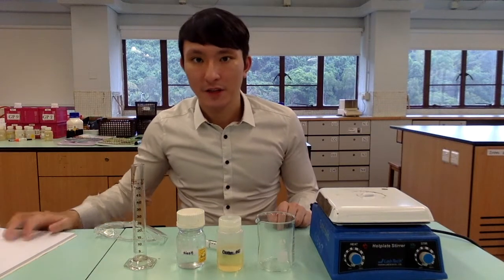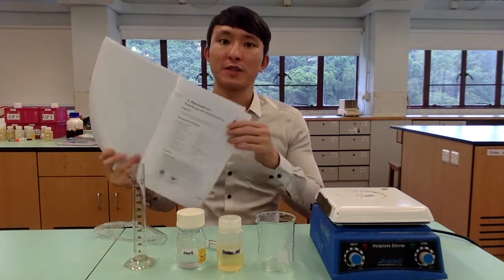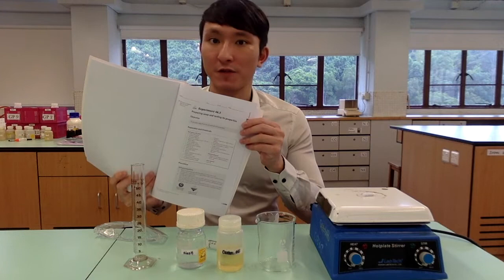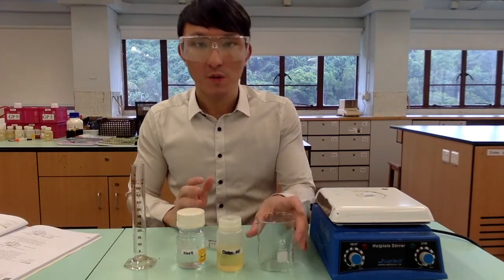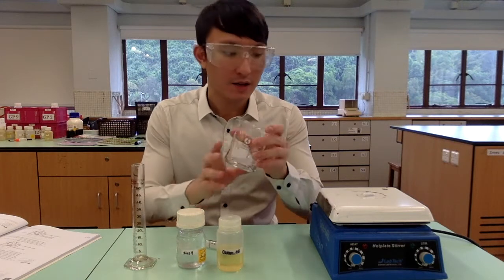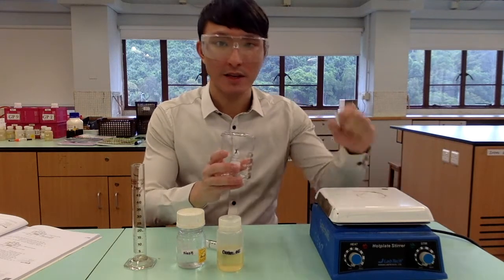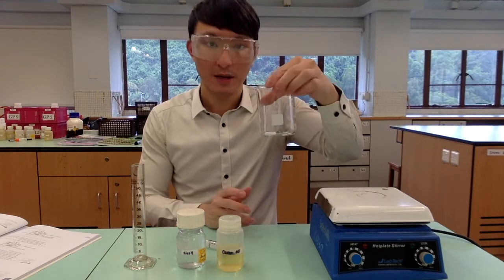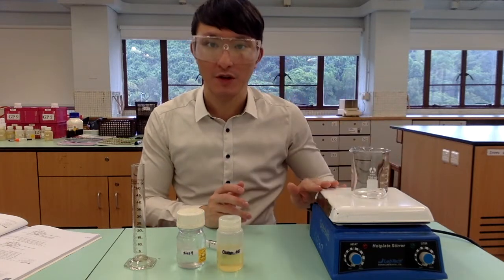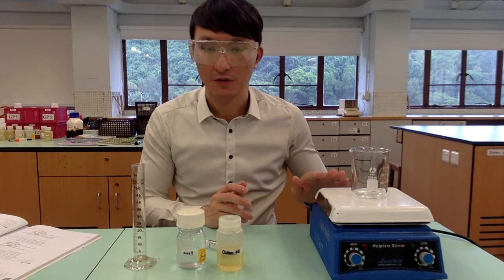Hi, in this video, I'm going to show you experiment 46.3, the preparation of soap. So first of all, we will have a beaker, and to that we will add the stir bar into the beaker. And we will put the beaker on top of a magnetic stirrer plus the heating stove.